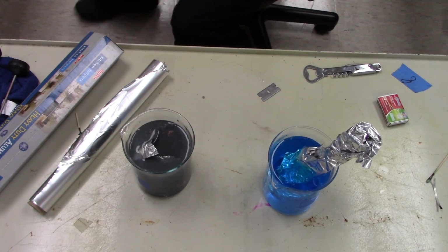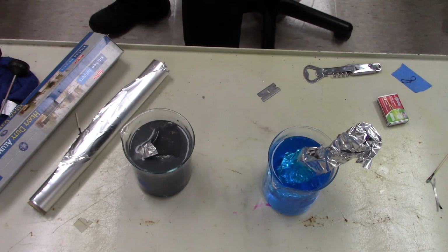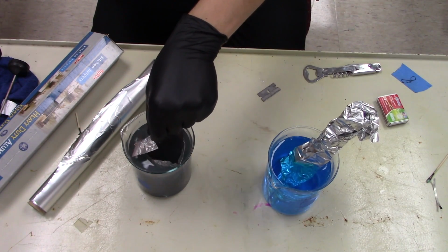I'll just put that in there for now. So if we look here, a single replacement reaction is, say there's a couple and then there's some guy, he's all by himself. He's going to replace the one guy, so now top hat guy is the sad guy, right? So what happens in this reaction is we have solid aluminum all by itself, and you can see it's not doing anything. This has been in here for over an hour.